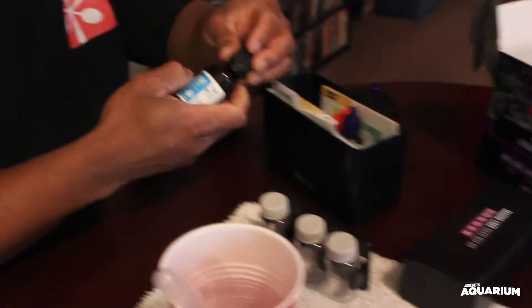In comparison to the API, some of the levels were almost pretty much accurate. When it comes to the nitrate test, the PPMs were pretty much in lockstep — API pretty much nailed it. The ammonia one, they didn't — it had 0.25 on the API, this one had zero, which is good. Nitrite was pretty much dead on with each other — reading zero here on the Red Sea, and also reading zero from API.